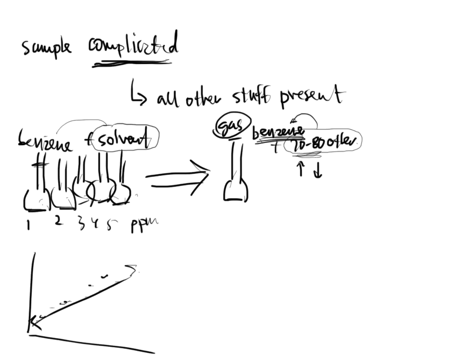Ladies and gentlemen, in the last video we talked about standard additions, and we said that standard additions are very important for complicated samples. And we said that a standard in a laboratory that would just have benzene in it with the solvent isn't necessarily the same as a sample that contains benzene and multiple other things, like a gasoline sample. So we said we can't really compare apples to apples. Sometimes there's no interferences at all, and these standards will work with the sample that's brought in.